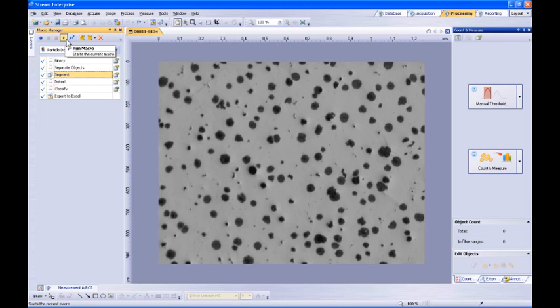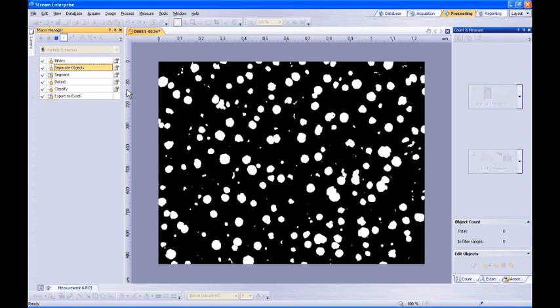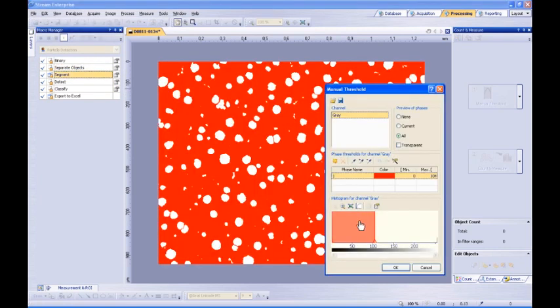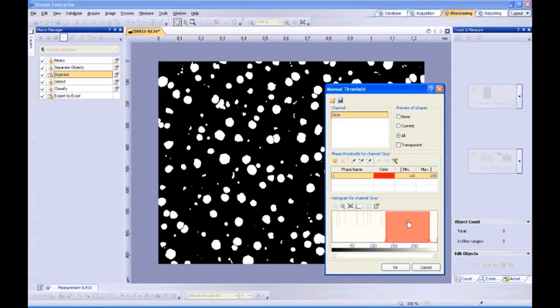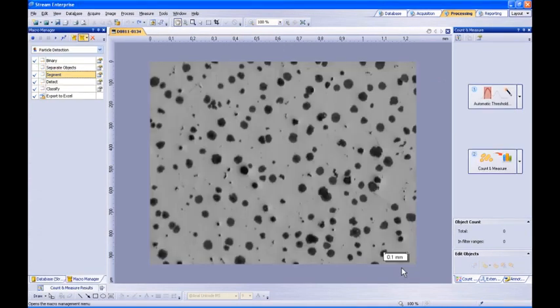When the macro is run, you will now notice that the operator is prompted to set the segmentation grayscale thresholds. By default, the macro is only available to the author.